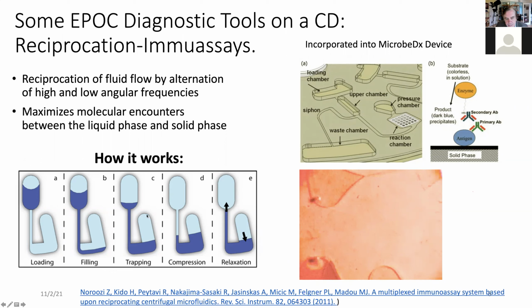And now what happens, this chamber here is closed. And what that does is the liquid compresses the air. And the higher in RPM, the more this liquid is compressed into a smaller and smaller volume. So if I want the liquid to go back, you know what I do? I go lower in RPM, I slow down, and you can see the liquid goes back up.